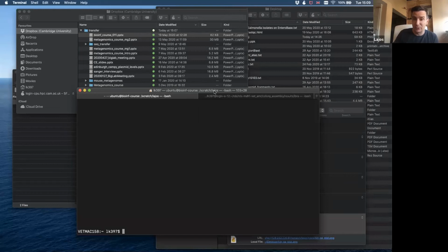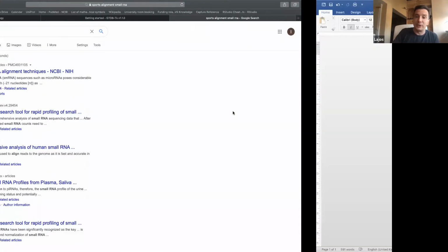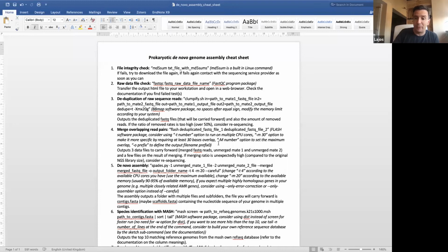I only sent sequencing to a place where they only do the sequencing and send the FASTQ file, but they don't do the assembly. But I think you always have the right to ask for the FASTQ files as well. Especially if you have a problem, you can go through this whole pipeline step by step and check where there is a potential problem in the data analysis.